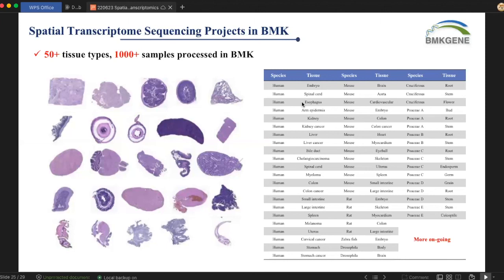Does the high resolution lead to more gene reads, or rather just mapping the location in certain space? It's a very good question, because some people may think that with higher resolution we need much more data production. But actually, think of it as having a certain number of mRNA molecules expressed in your tissue.